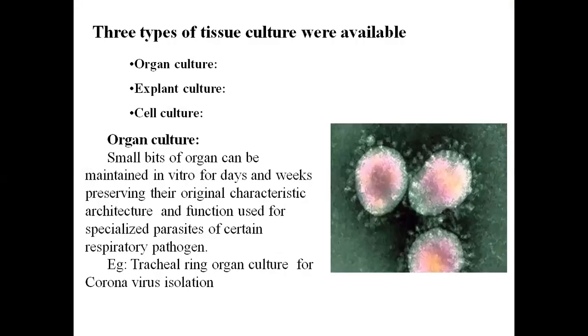Next, come to the tissue culture. There are 3 types of tissue culture.